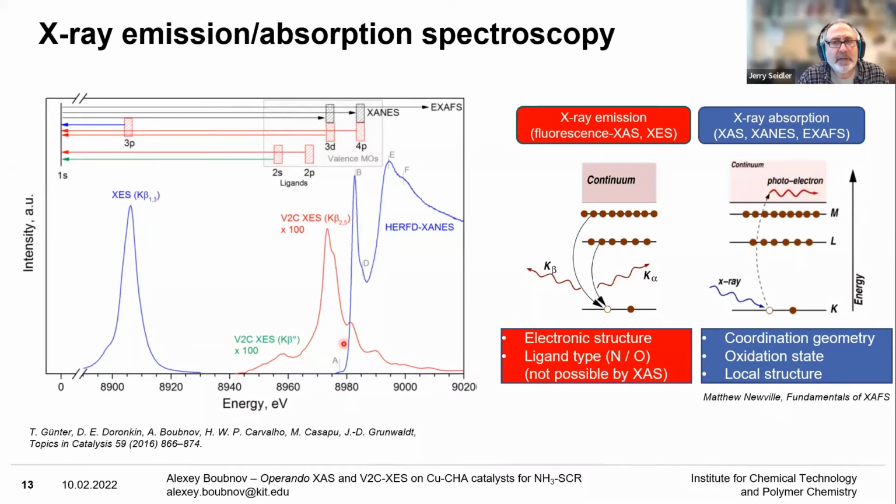The reason I ask is, if it was a XANES rather than a HERFD spectrum, I would have expected that your large pre-edge feature B would align with a dip in that high energy tail of the valence-to-core emission. And so it looks like it's about half a volt off from that, right? The emission coming out of the sample gets partially absorbed by the XANES, by the mu of E. And so I would usually expect little dips and all the wiggles in the high energy tail of the valence-to-core to be inversely related to the absorption coefficient. Now, yeah, so it could well be that that's the case, but we can't see it here because HERFD, depending on where you are on your, I'm assuming a K alpha 1, it could shift things a little bit. But anyway, that's my question.